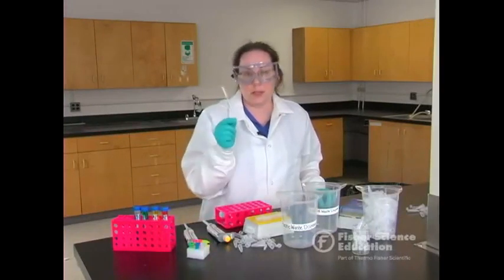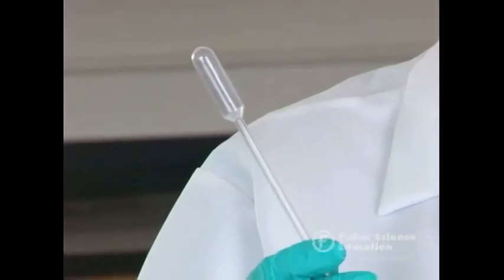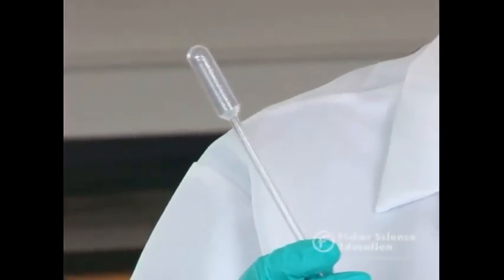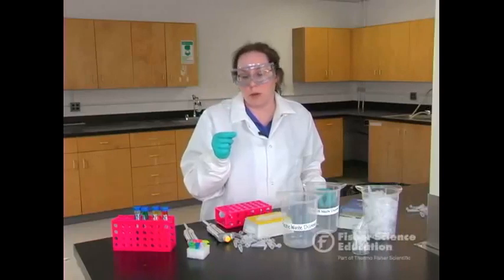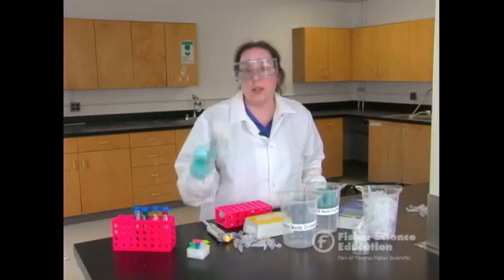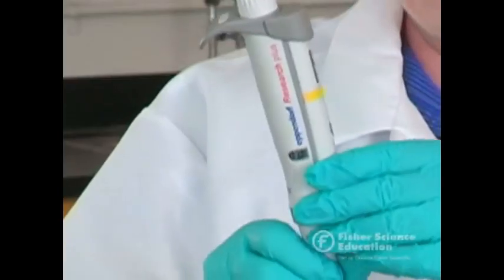And most of my students, when I talk about a pipette, this is what they think of. This is pretty much all they use in biology, unless you're from a program that has a really great biotech program and those teachers share with your kids. And so we want to toss this one out the window, and we want to get them using some really cool pipetters. These are a really great tool.